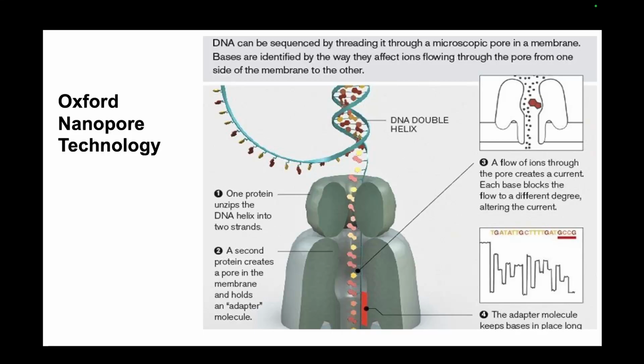long reads of sequences together. If you are doing some sort of structural variant calling, or where you are detecting duplications inside the genome, these long read sequencing technologies help where there are duplications or large stretches of the genome where there are duplicated sequences.